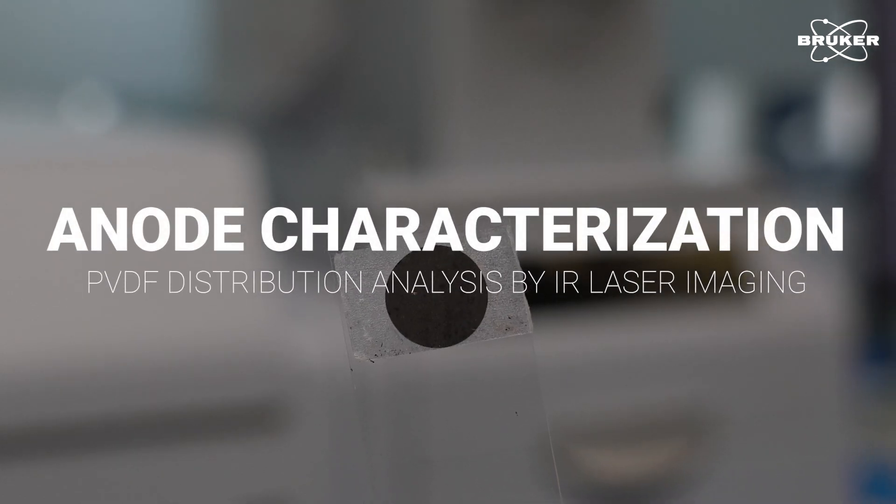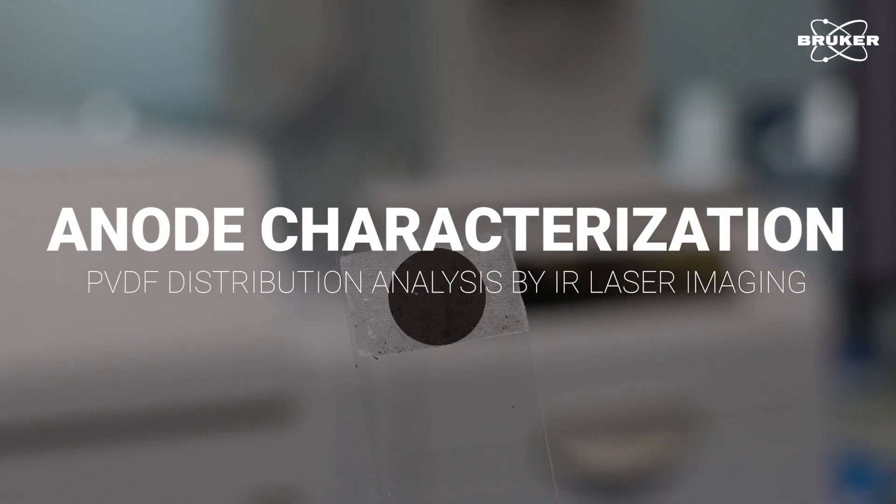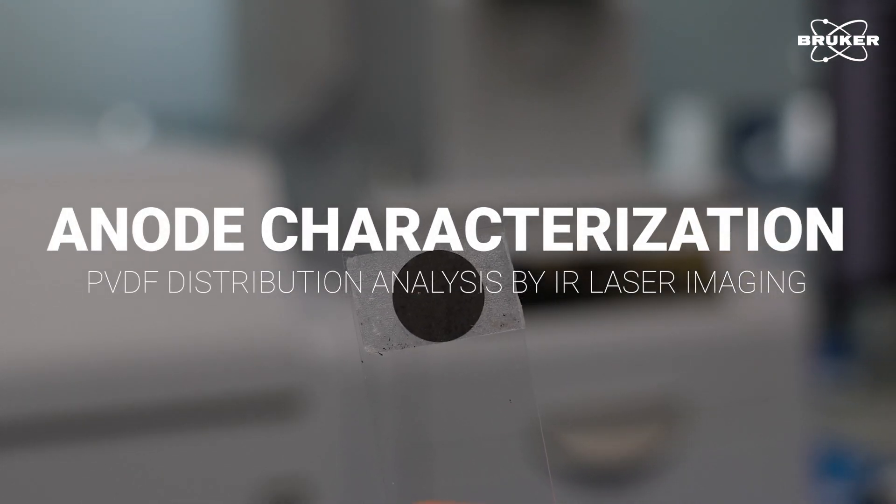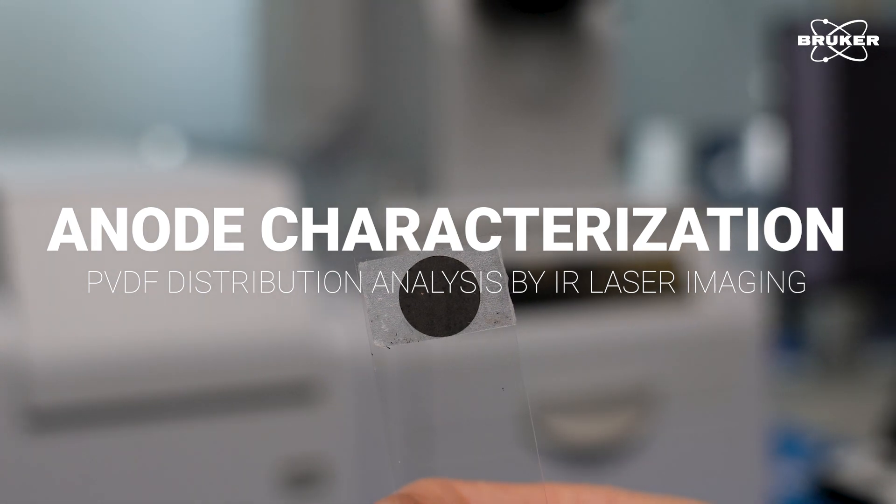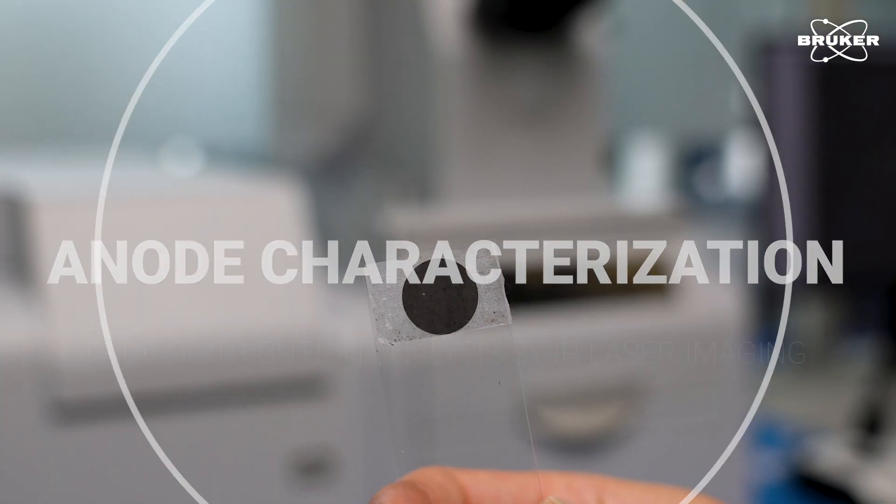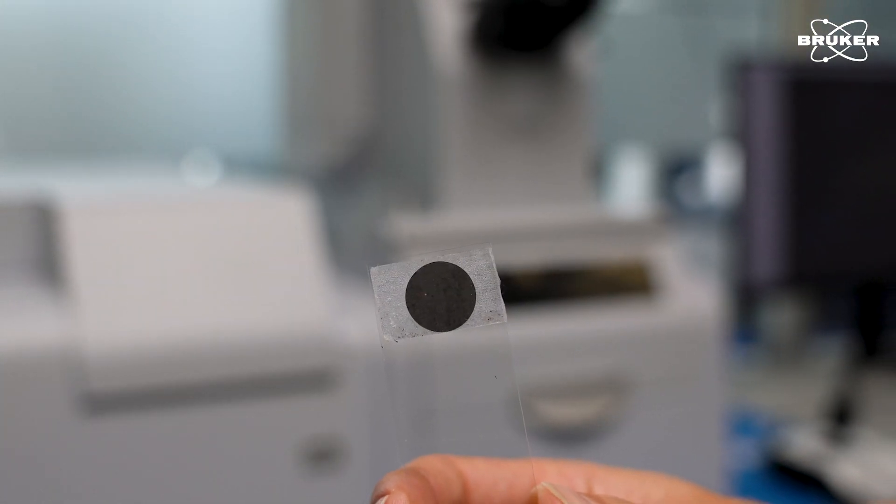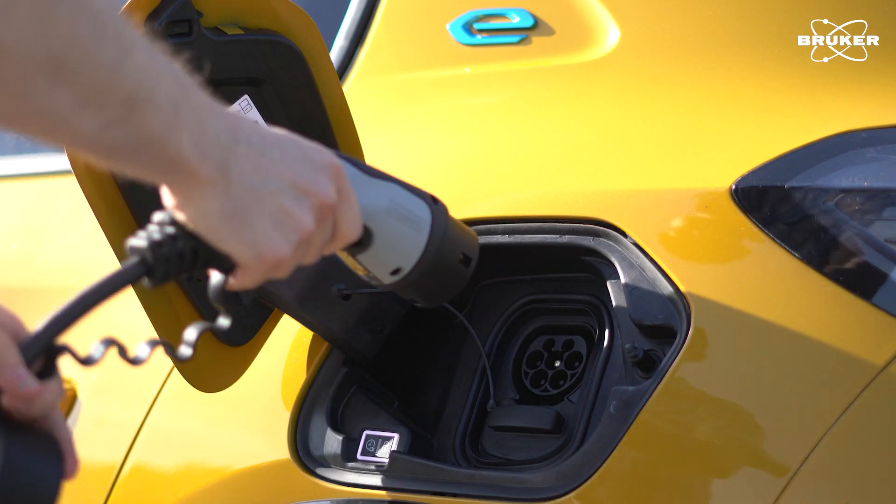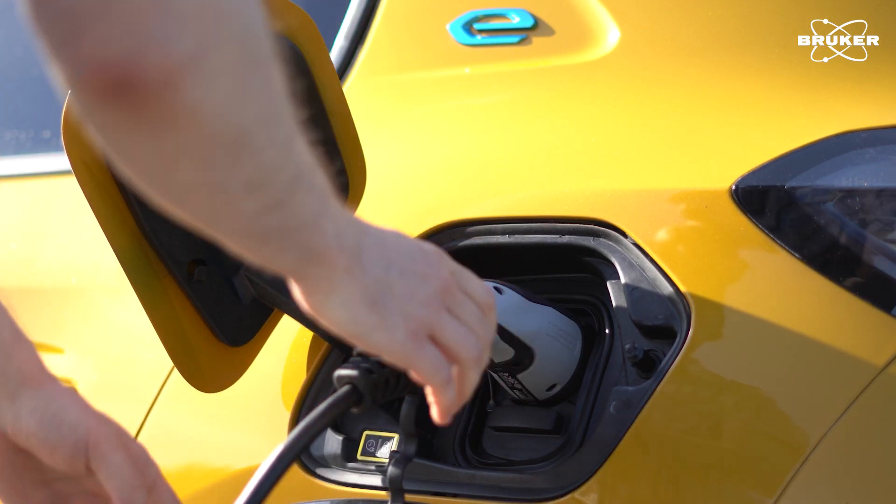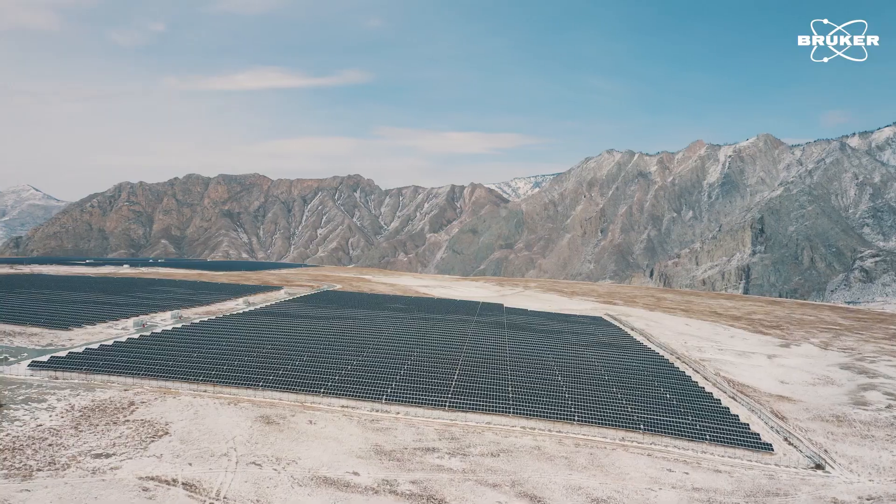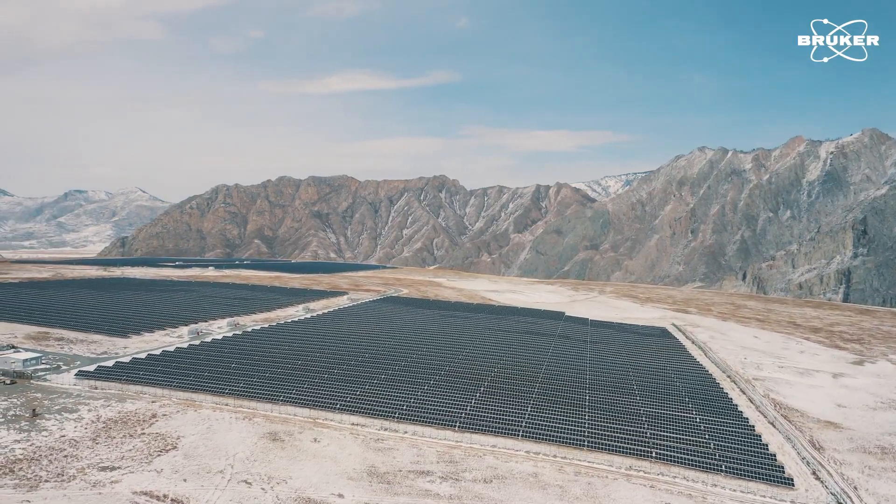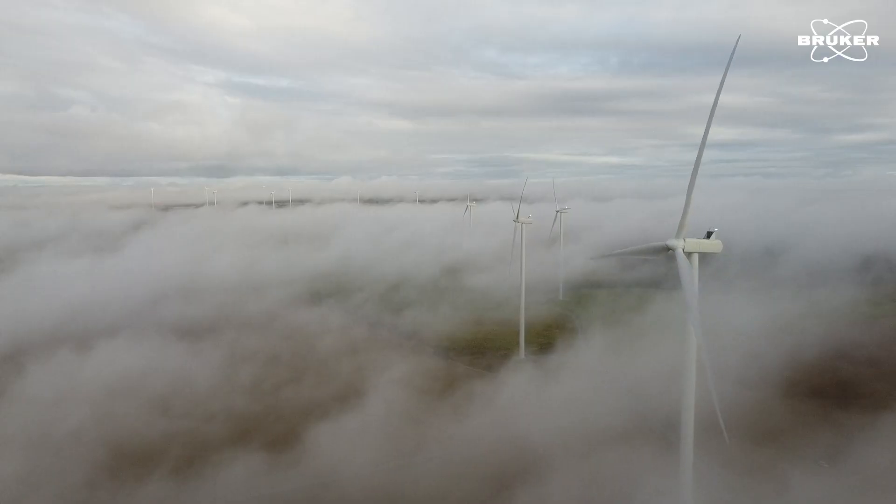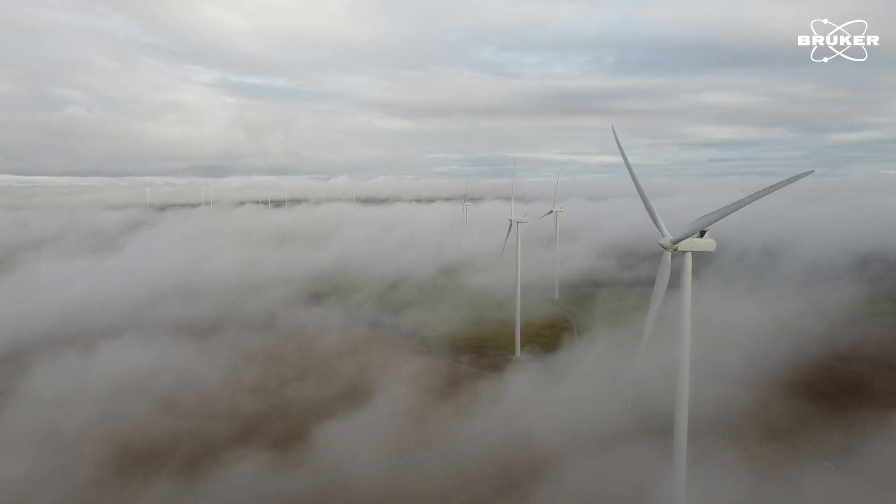This is a lithium-ion battery anode containing polyvinylidene fluoride, PVDF, a specialty plastic widely utilized in electric vehicles, as well as portable and stationary energy storage systems for wind or solar power.